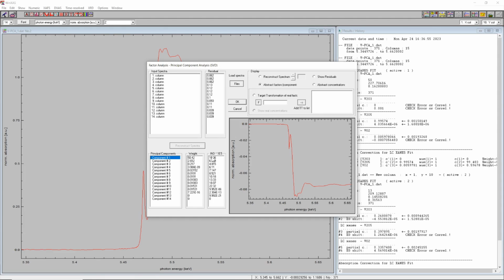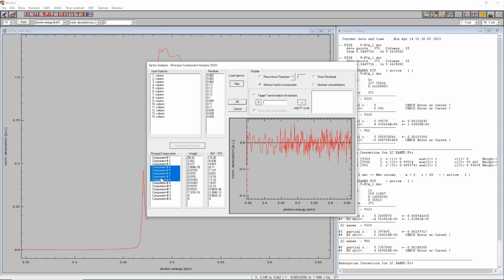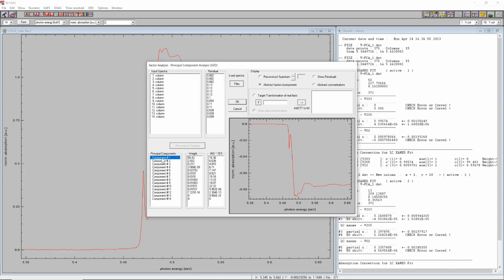And it does that. We have 16, 6, 4, 6. So at 3 components, indeed, it seems that those 3 components contain the data, are sufficient to reproduce the experimental spectra within the noise, and the remaining components then only show the noise. So this is our number of primary factors, of primary components. This is the number of references we need now to quantify, to reproduce the experimental spectra really, and to do a quantification at the end.